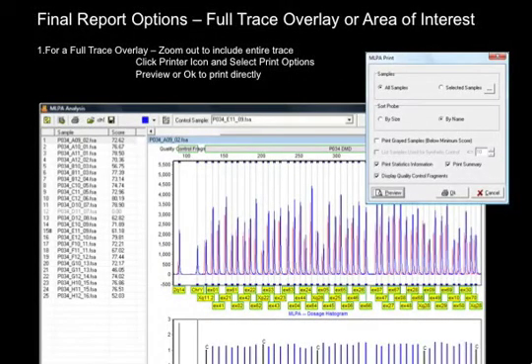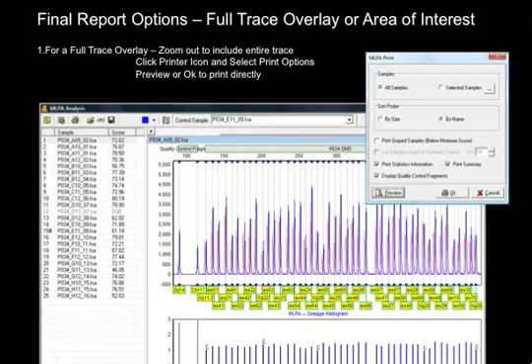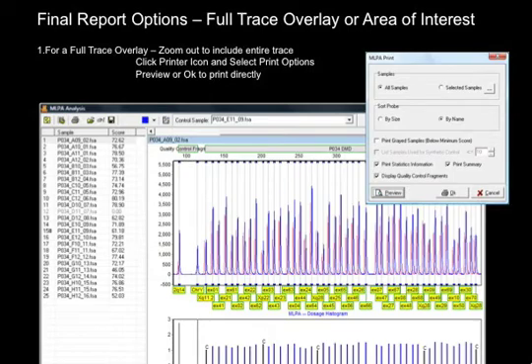The final report contains several customization options. To include a full trace overlay in the final report, use the mouse to zoom out and click the printer icon. Select the desired print options from the dialog box. You may select to print all samples or selected samples, and sort the probe by size or by name. If a synthetic control was used in the analysis, select the option to list samples used for the synthetic control. Statistics information includes the number of probes, the mean, and standard deviation. This is used by many labs as a quality control feature. If print summary is selected, the summary table will be located at the end of the MLPA report pages. Display quality control fragments will list and highlight the quality control fragments in the report table.